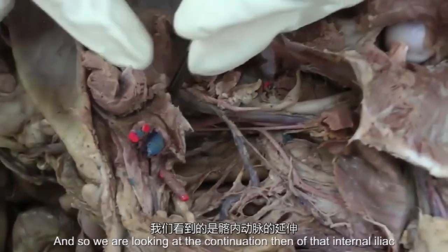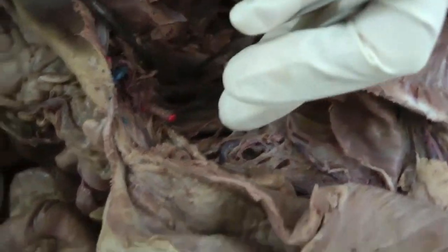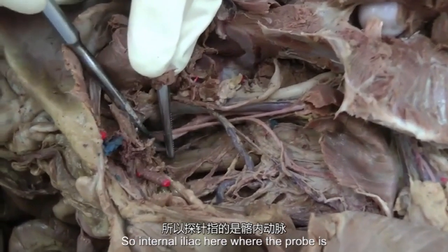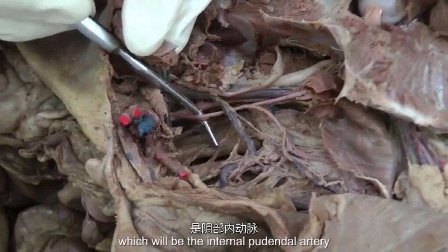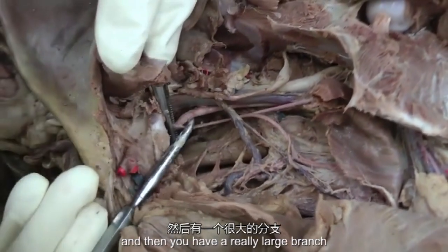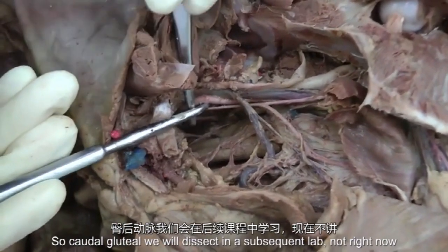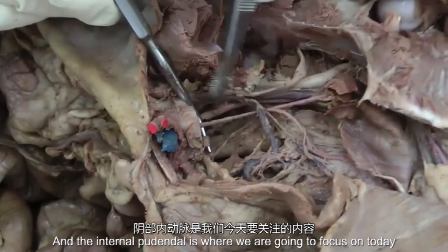Then we're going to push everything out of the way here, make a little hole, and we're looking at the continuation of that internal iliac right here. So internal iliac, here where the probe is, and then you'll have a small branch, which will be the internal pudendal artery, and then a really large branch, and that is the caudal gluteal artery. Caudal gluteal we will dissect in a subsequent lab, not right now, and the internal pudendal is what we're going to focus on today.